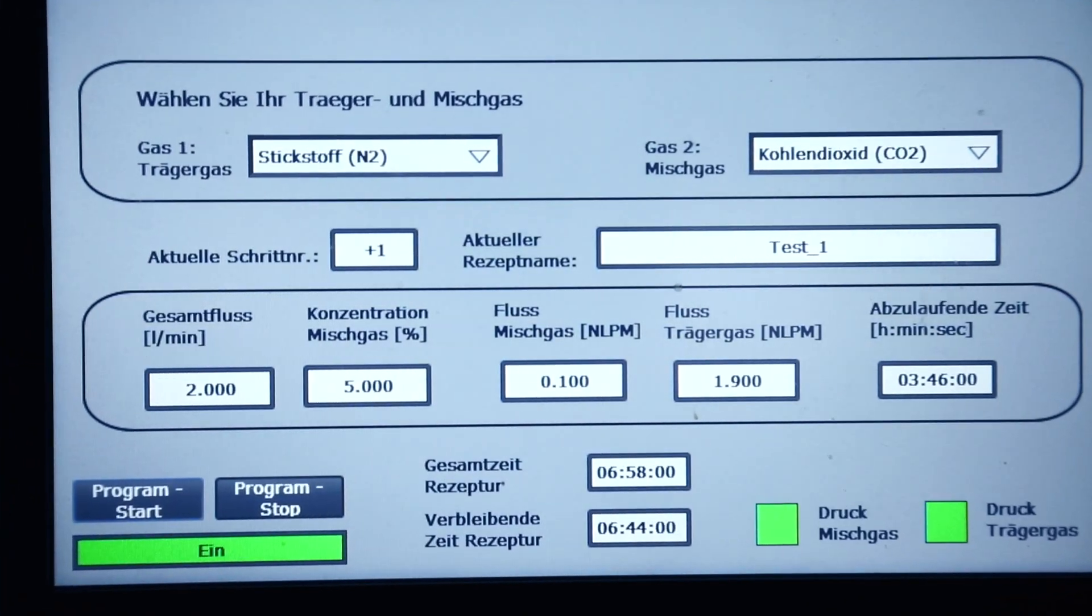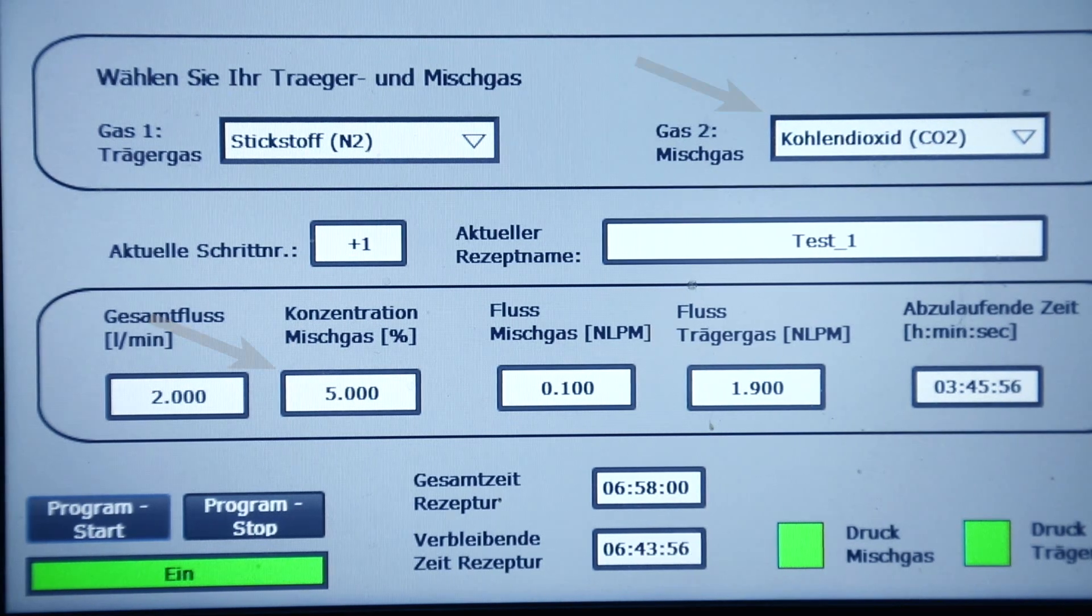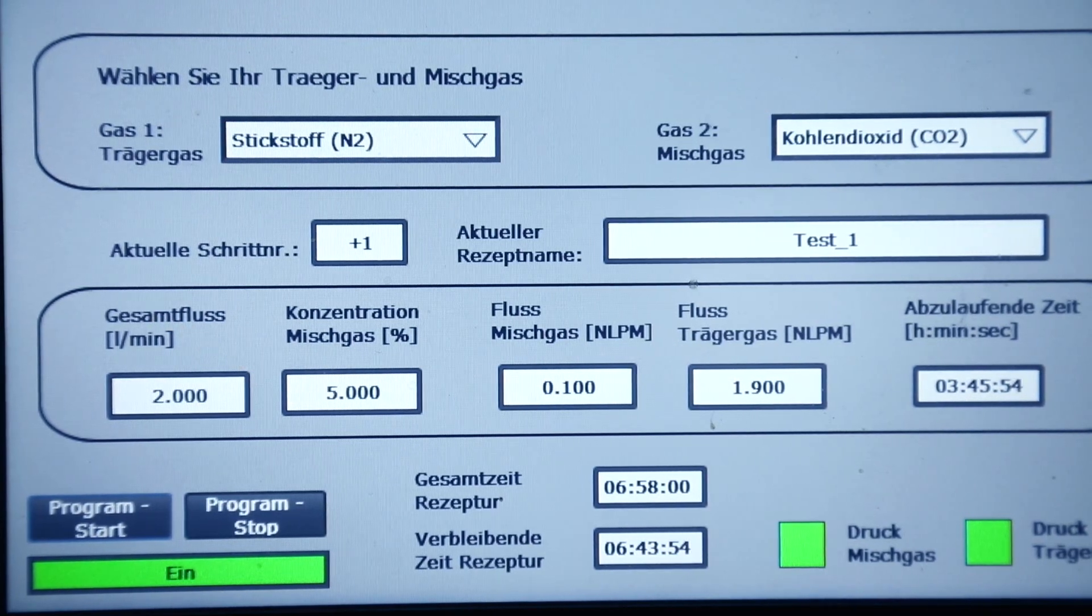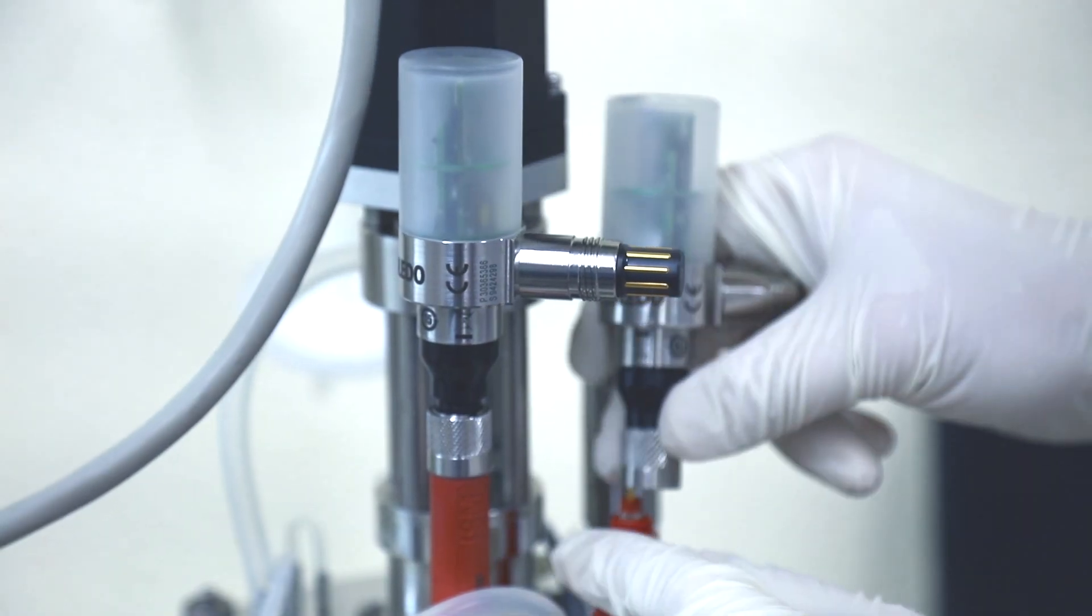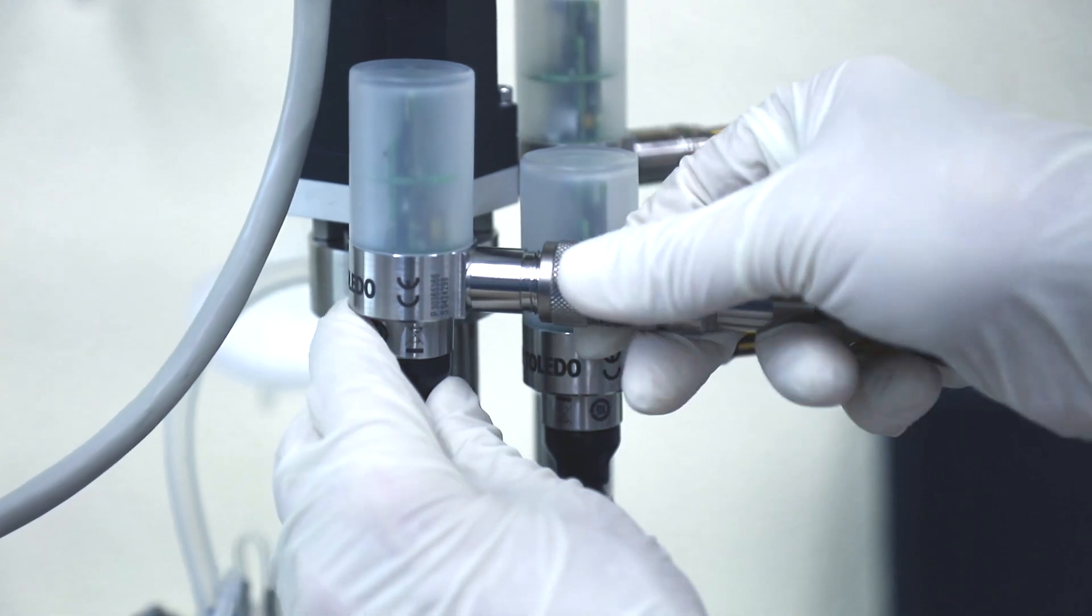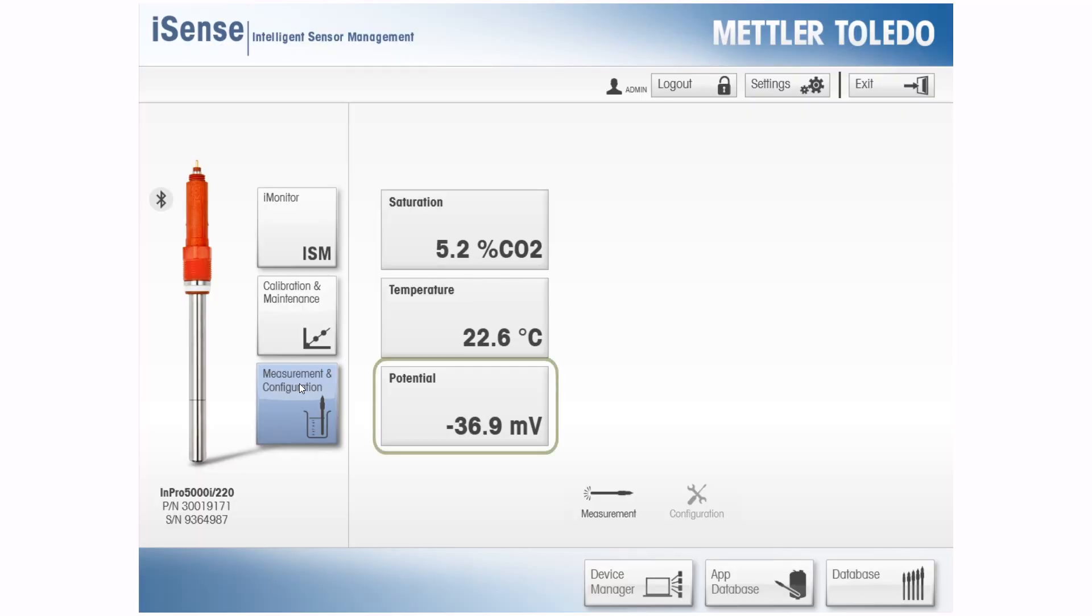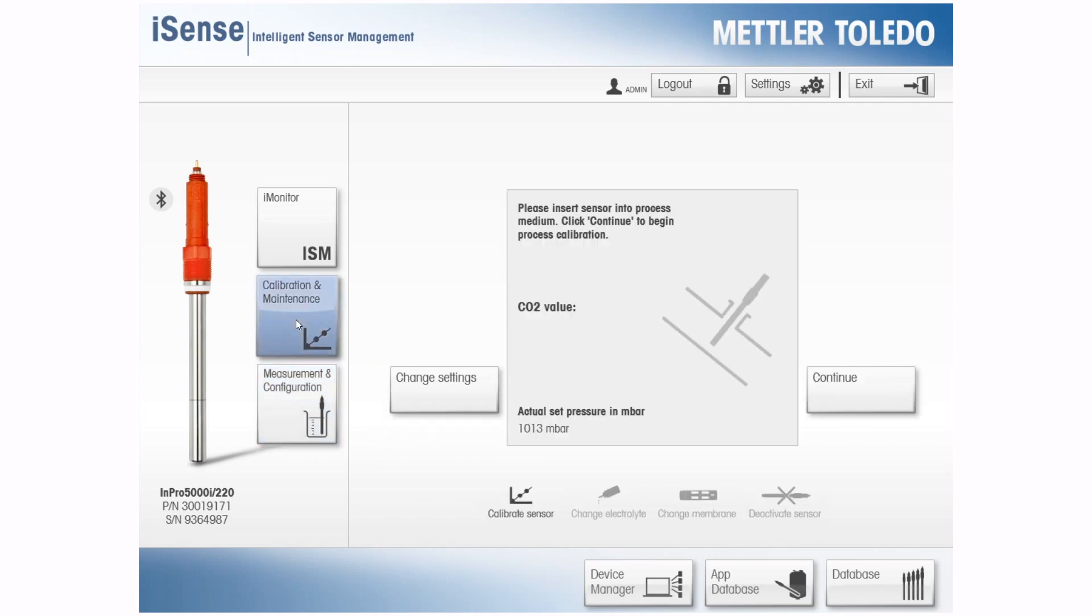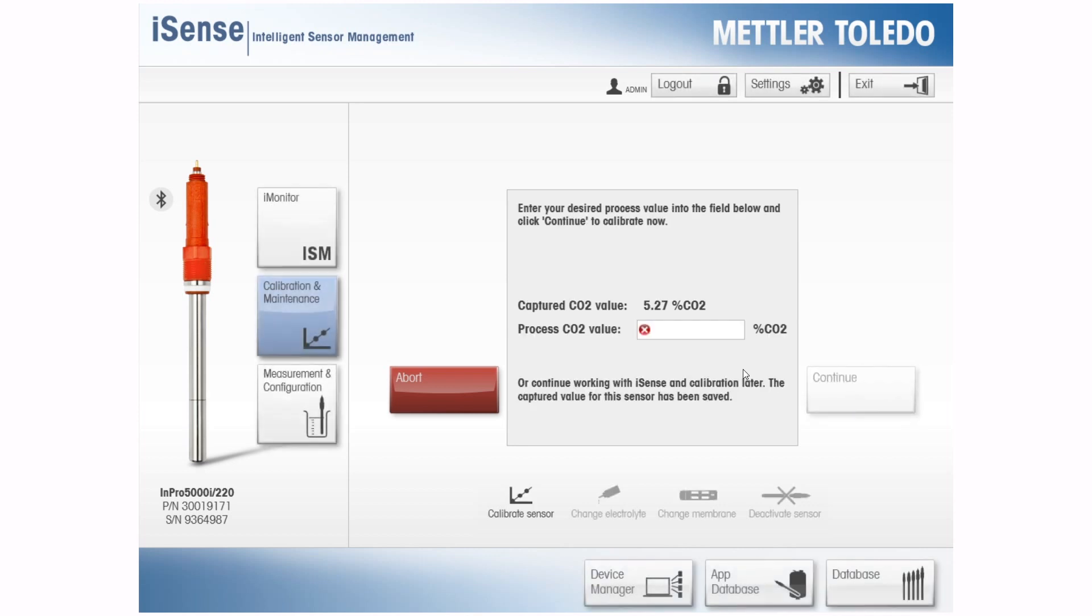We recommend using a gas concentration in the same range that you want to measure. We're using 5% CO2 saturation. Turn on the gas supply to saturate the media with CO2. Monitor the millivolt reading of the NPRO 5000i. Here, we're using iSense. Once the measurement stabilizes, a process calibration and adjustment procedure can be performed.